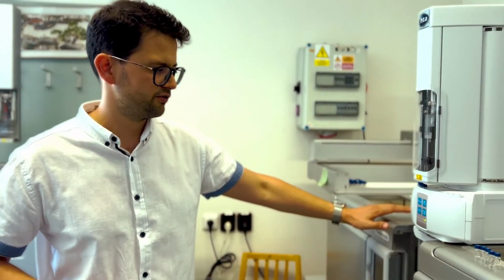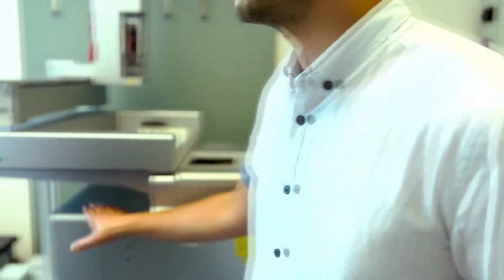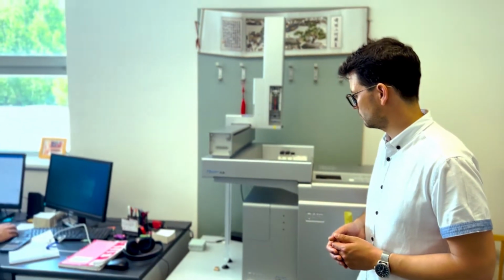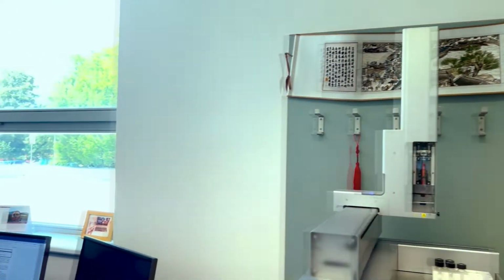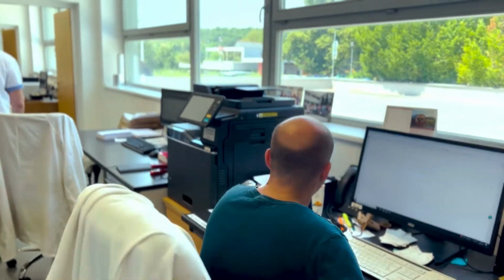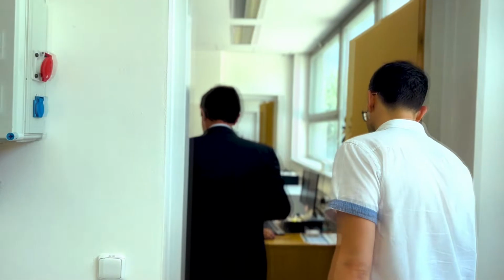What do you measure here? The properties of the input lipids and final products, which are biodiesel. Here we measure the content of alcohols, and here we measure content of biodiesel and also the content of impurities, which is the unreacted lipids. And the same thing here, but here is a small mass spectrometer, which can also identify the compounds which are measured, for example, impurities. This is a different project, but still using waste to produce biodiesel, right? Yes, but the challenges are still the same in order to design a sustainable solution, which is technological and economical viability.